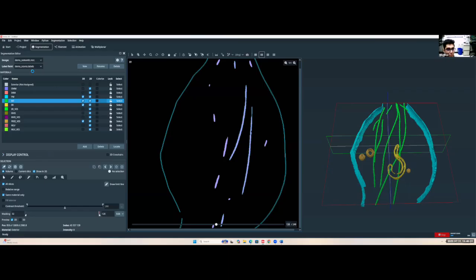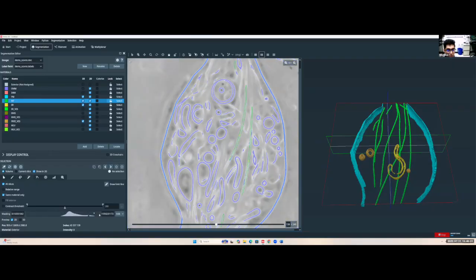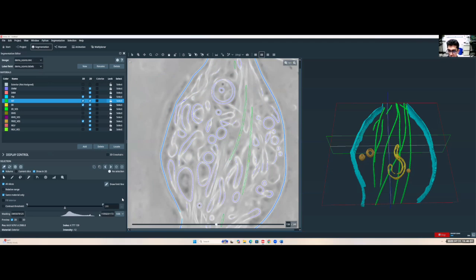Whenever you're done, you go back to your scores file, and the mask will return here. Again, you want to change your histogram like this and go back to segmenting how you were. I'm going to take a pause here and let you segment on your own, and I will come back and return with my full segmentation where we can talk about what we see in this segmentation and how to visualize stuff further in our segmentation.